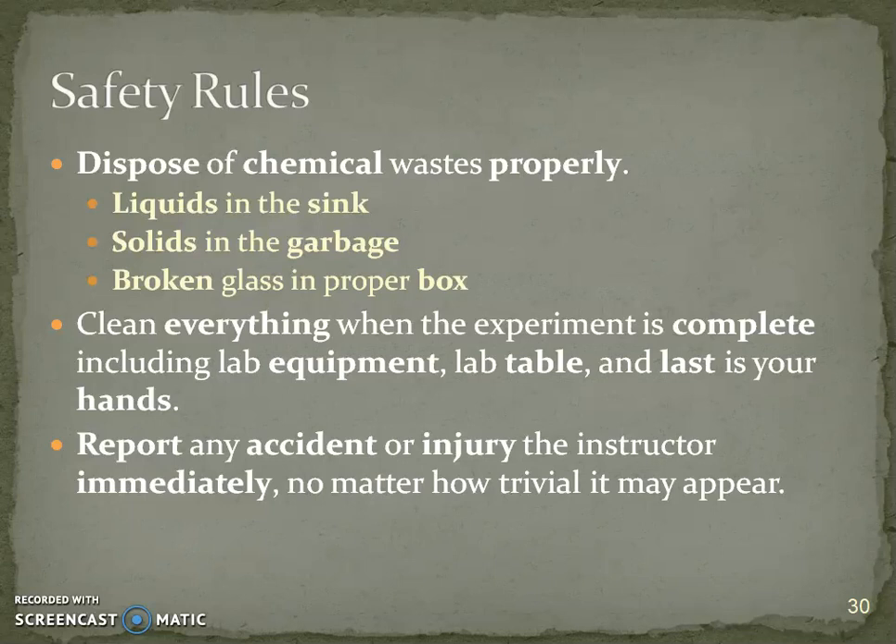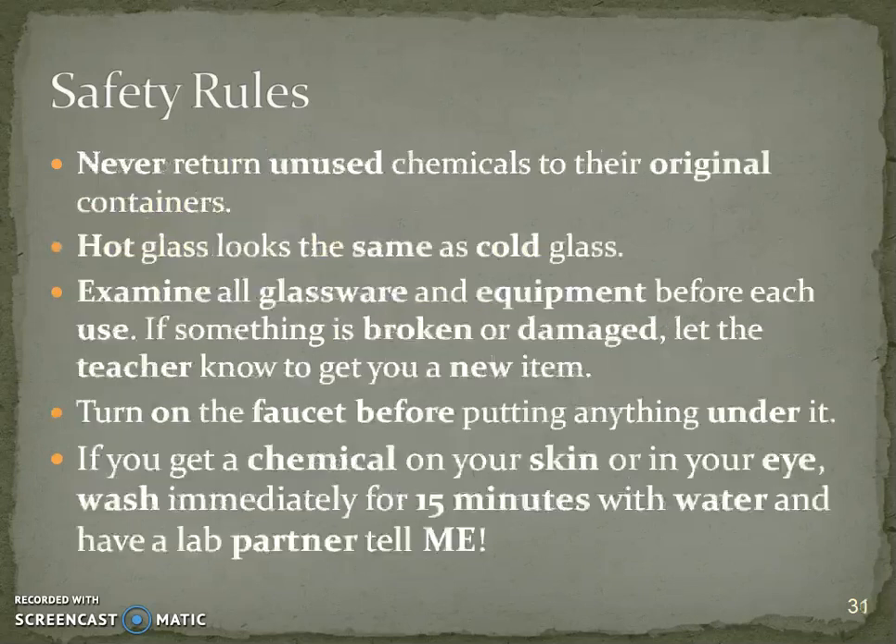If anything is broken, there's a proper box in the back of my room for broken glassware. Clean everything before and after, and the last thing you clean is your hands. Please understand I need to know about any accidents or injuries so I can get you back into a safe environment. Don't return unused chemicals to original containers because it could cause cross-contamination. Hot and cold glass looks exactly the same, so examine glassware before you use it and let me know if anything is broken or damaged.